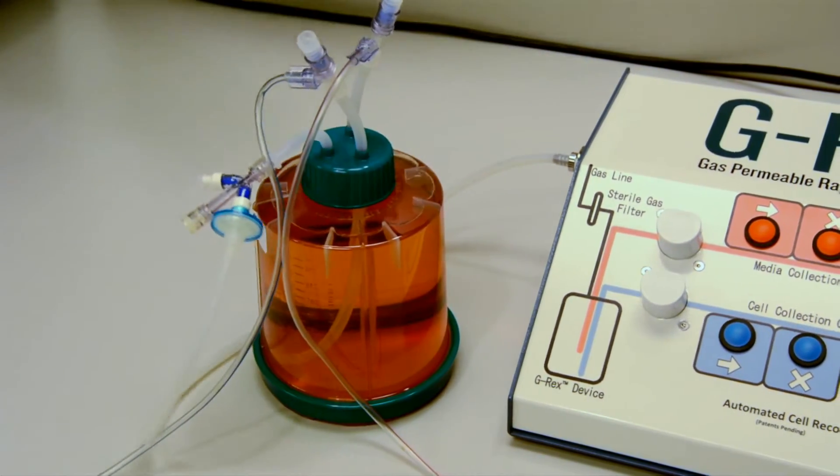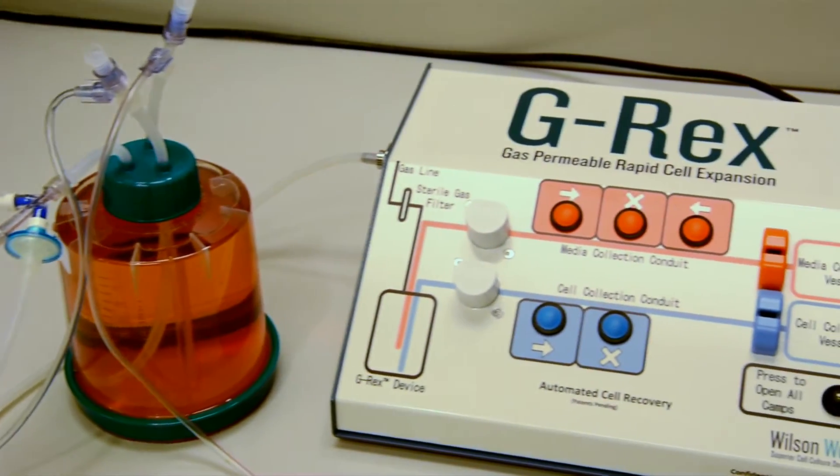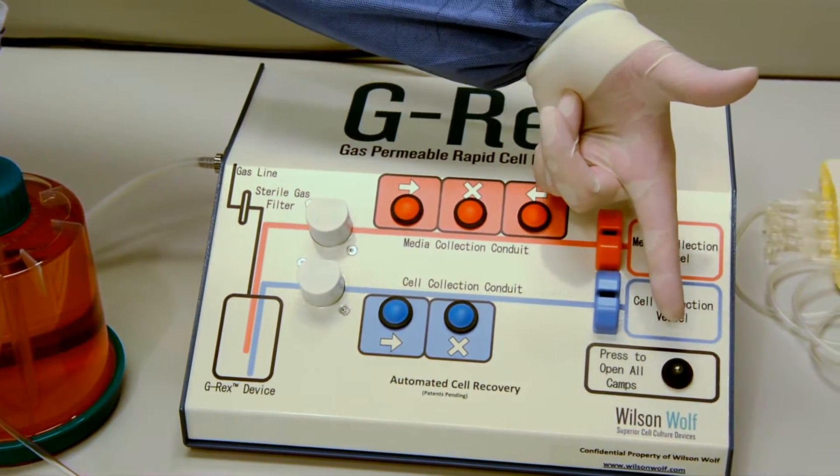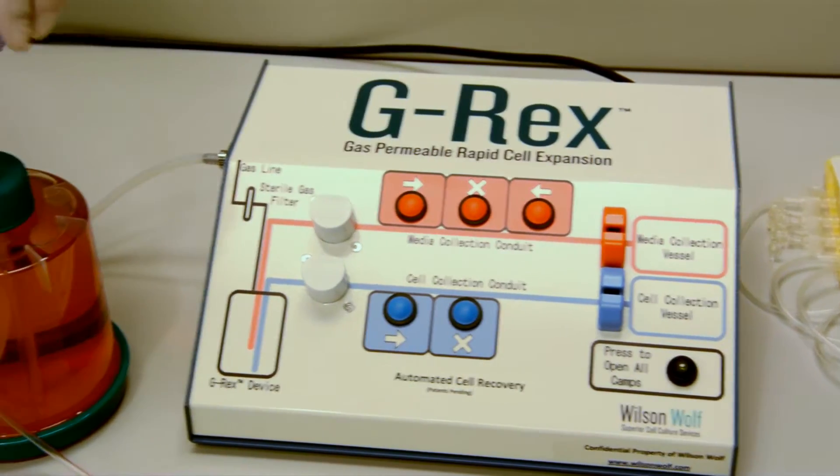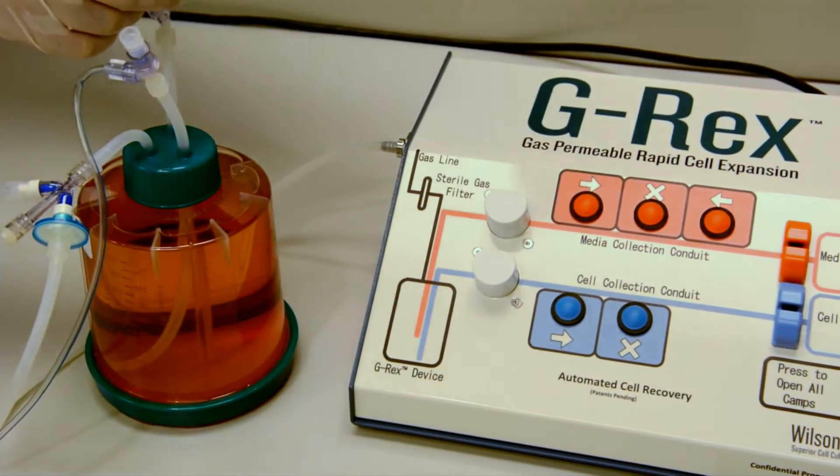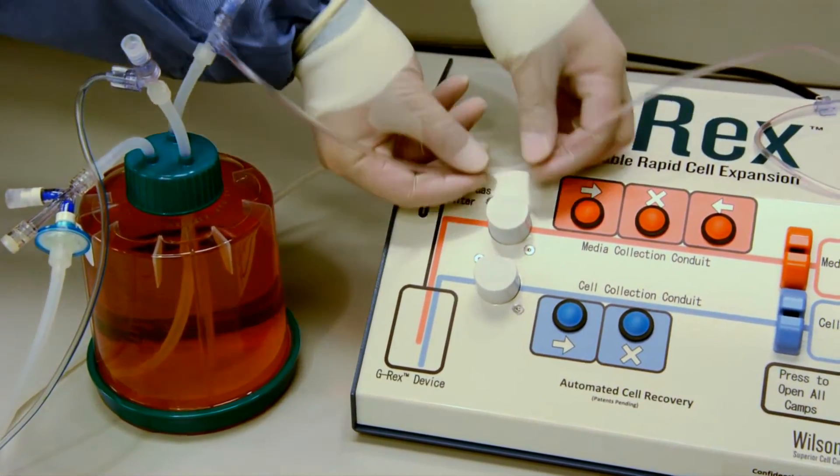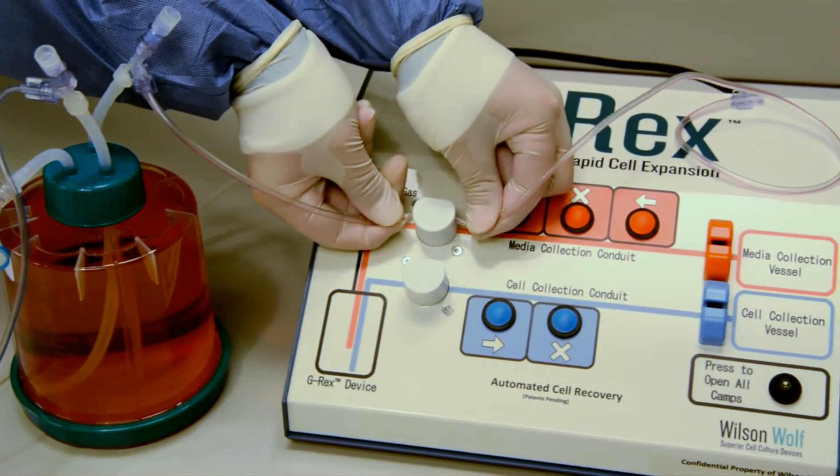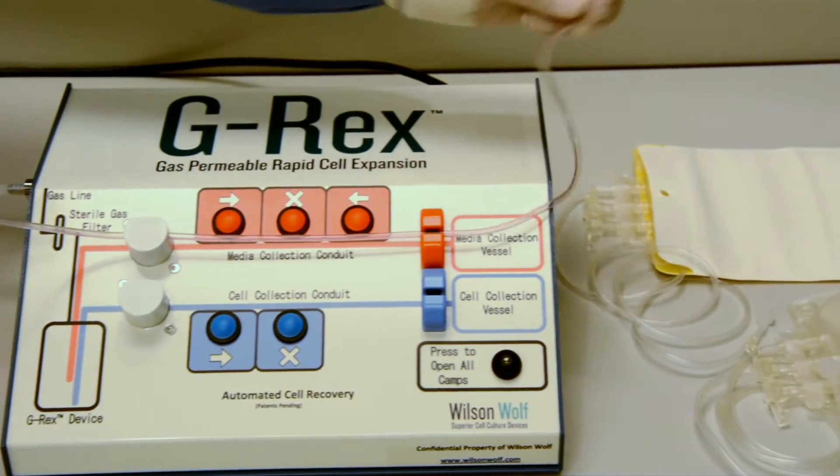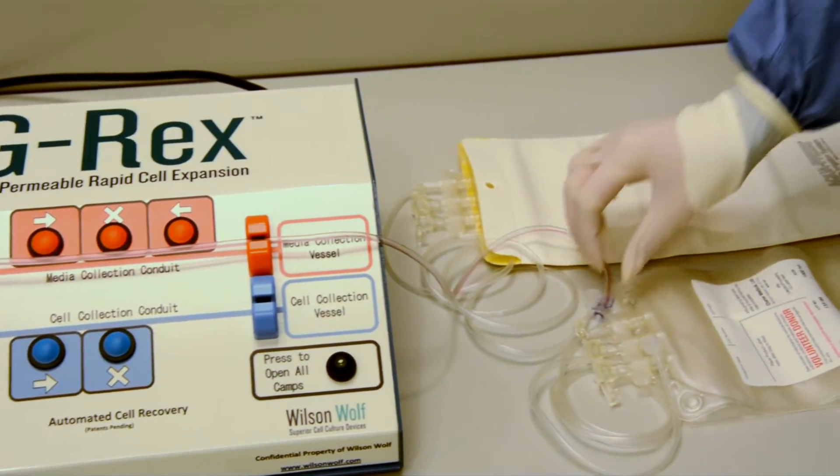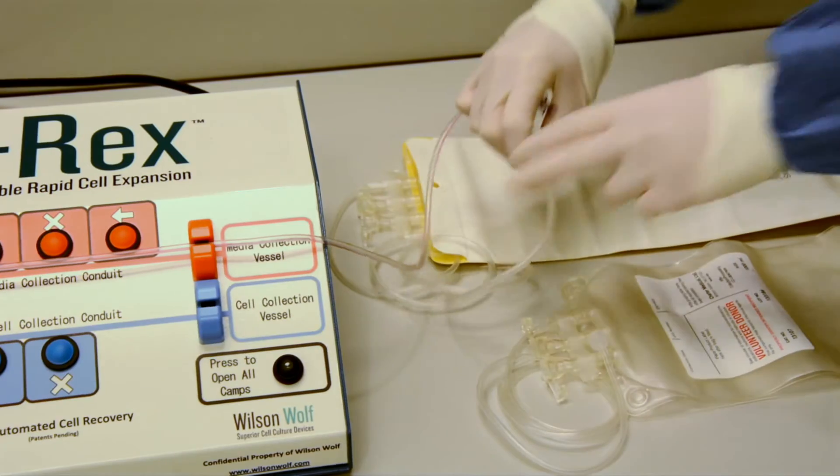In order to release both clamps and allow the lines to snap into place, we press this button and pass the orange media line through this clamp, which will automatically shut off once air bubbles are detected by this optical sensor after 90% of media is drained.